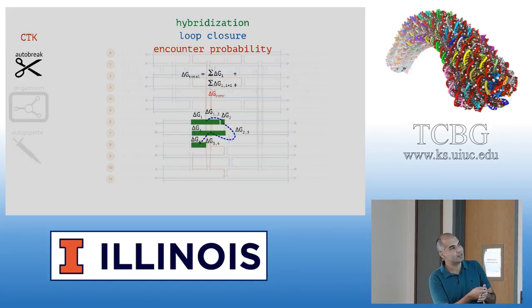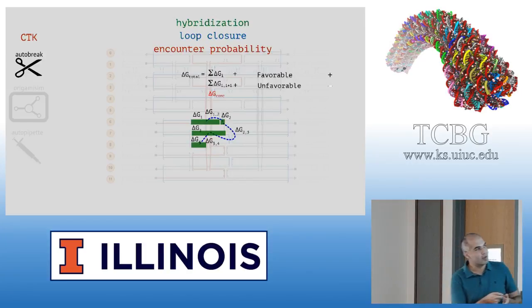We can just make it a compact form like this. So there will be, let's say, n terms for this. This will be n minus one terms, and then there's only one term per oligo. So it's a favorable term. And this will be an unfavorable term because you're bringing distant regions in the scaffold together. So this will be one less than the number of intrinsic terms here. The way it works, you can kind of imagine, is that it tries to extend. After, let's say here, you come here, and then you have this unfavorable term, and then you go here, and then you have a block here, then you go to the next term, and you try to go as far as possible. And the reason is that there is a cost associated with this. To compensate that cost, you try to make it as long as possible.